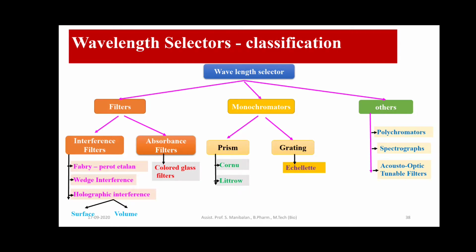And the grating is most important, and it is sometimes called the master grating, right? It can produce the exact wavelength, the most accurate one, nearly 99.5 to 99.8. It produces the exact wavelength by the grooves. Gratings are nothing but lines produced on glass plates or other transparent materials.